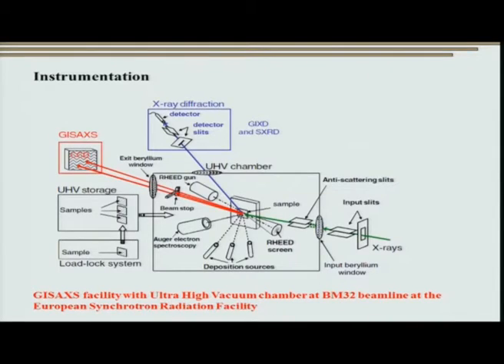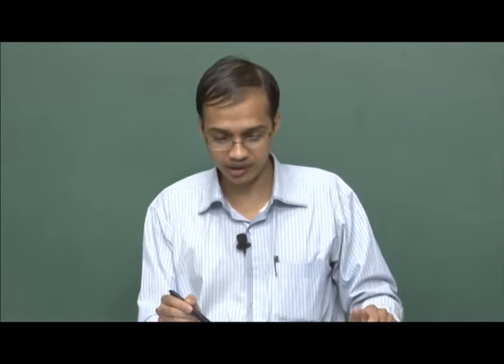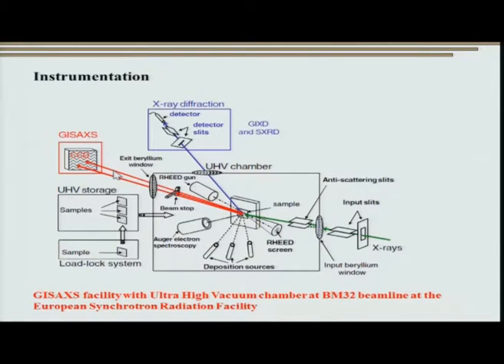in vacuum. So this assembly essentially shows that from a synchrotron we get a nice coherent parallel beam which is incident on your sample, and you see over here we have a beam stopper, because a direct incident beam can cause damage to our detector. You can see the GISAXS detector is placed right at a very small angle with respect to the sample.